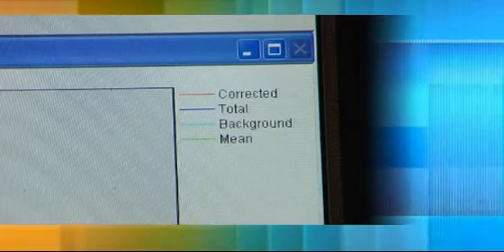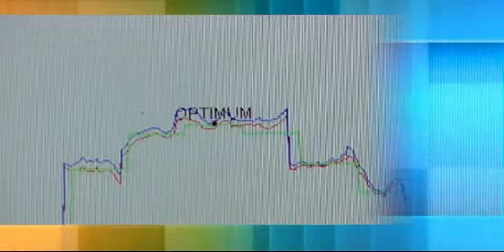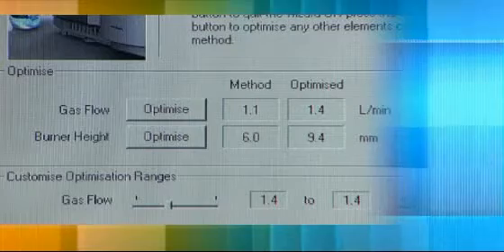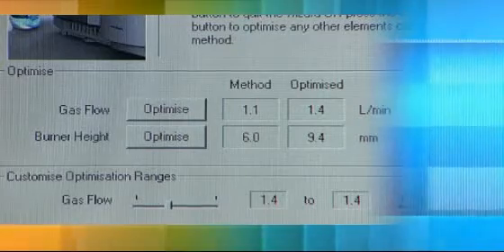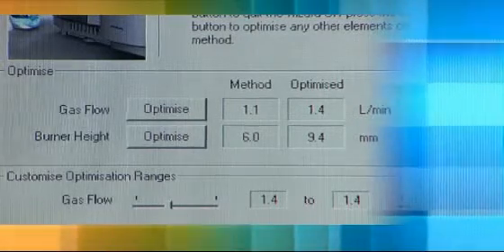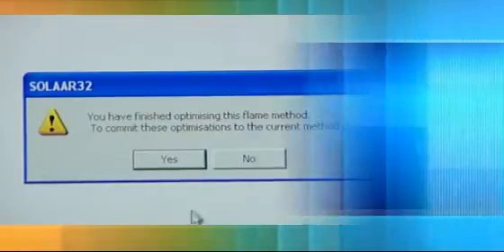With the ICE 3000 series AAs and SOLAR software, reaching peak performance is quick and easy. Fully optimising a flame method is achieved in a matter of minutes and the optimisation is performed fully automatically and safely.